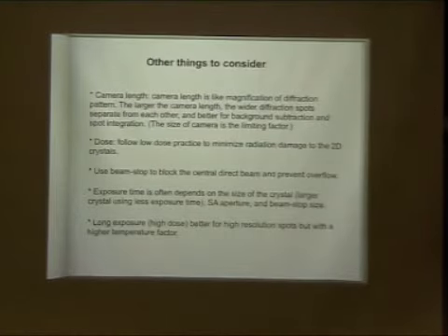So the thing is this: if you have a very small crystal, which is very well ordered, right? You want to use as long an exposure as possible to get the highest diffraction spots. However, in this way, your total dose used probably is an overdose. You still get high diffraction spots, but your temperature factor will probably not be very good.